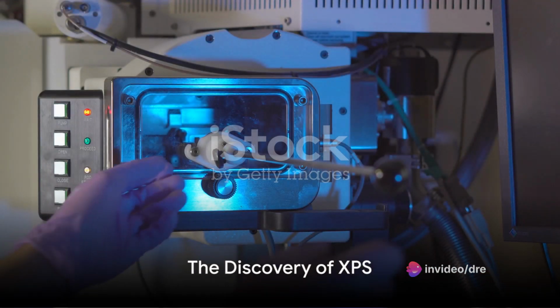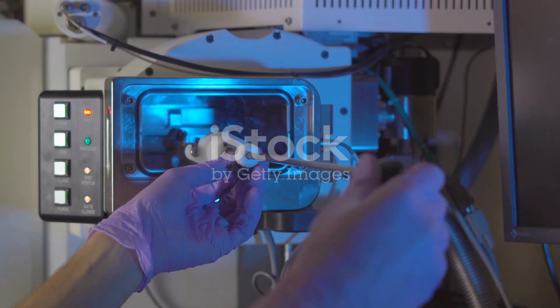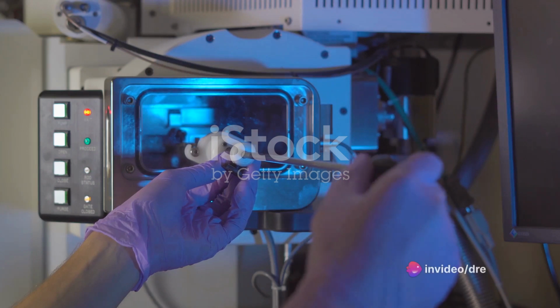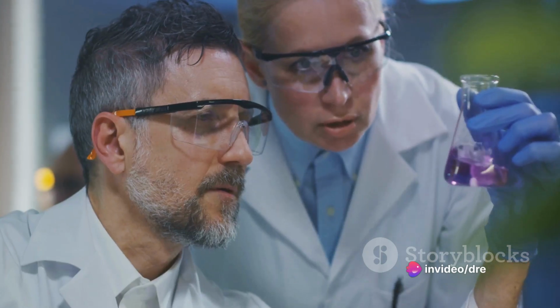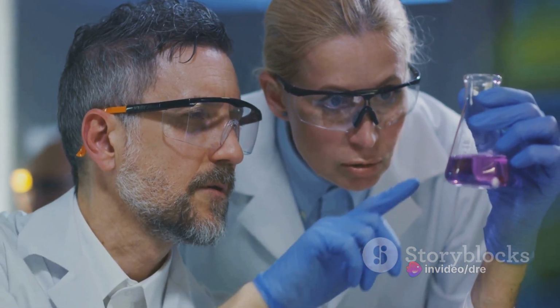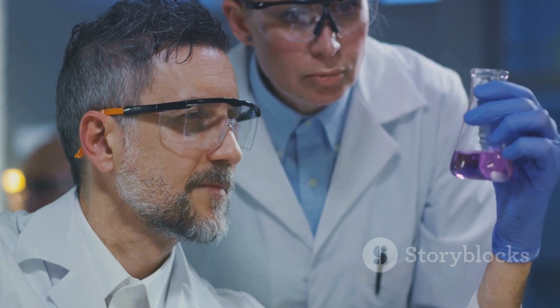The discovery of XPS is a fascinating journey that began with Heinrich Hertz. Hertz observed that ultraviolet-irradiated electrodes emitted more sparks, a phenomenon that would later be explained by Albert Einstein in his theory of the photoelectric effect, for which he was awarded the Nobel Prize in Physics in 1921.